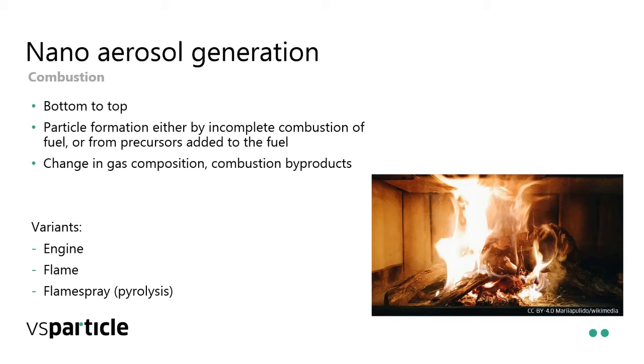Engines are typically used. You could use a flame, or flame spray pyrolysis is a common way of making very nice particles for materials production. One issue with these materials is they're difficult, I think, for making test aerosols, right? An engine tends to be bulky, a flame is finicky and tricky because you really have to manage your fuel and your airlines well. And any change in humidity or temperature will give you completely different results. And the other method is also not very suitable for more inline type production.